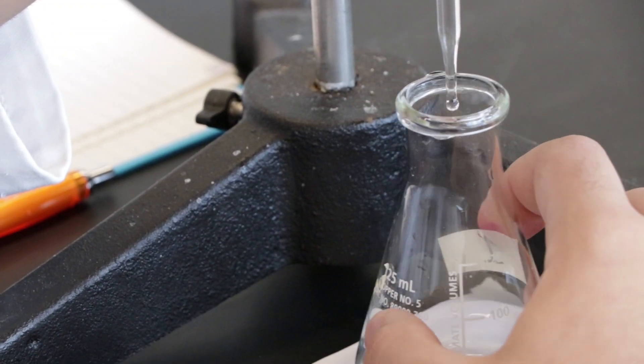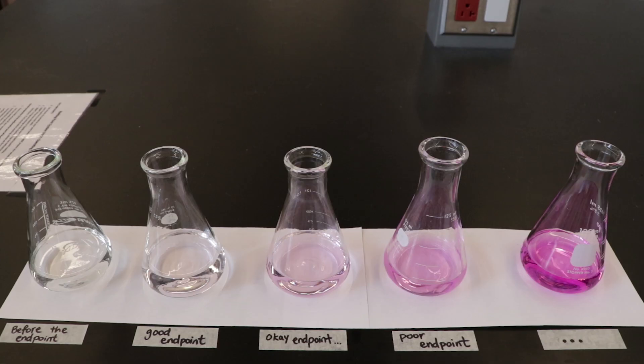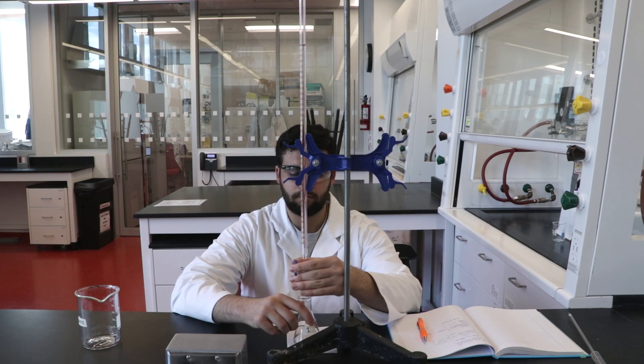As you add more sodium hydroxide beyond the endpoint, the solution will become more magenta. Here, the flask on the far left is before the endpoint. The second flask shows a good endpoint and the flask on the far right represents a poor endpoint. You should aim to achieve the palest pink color possible.